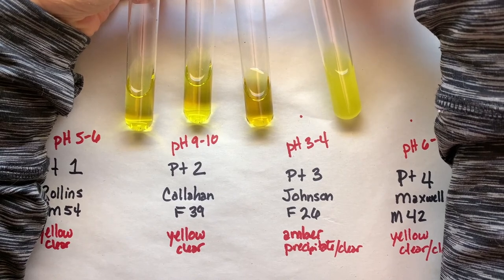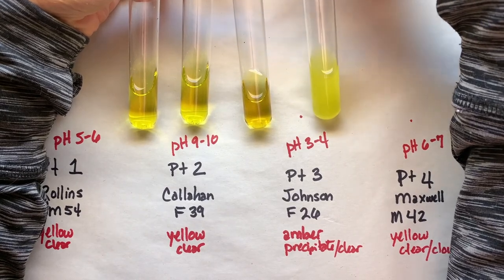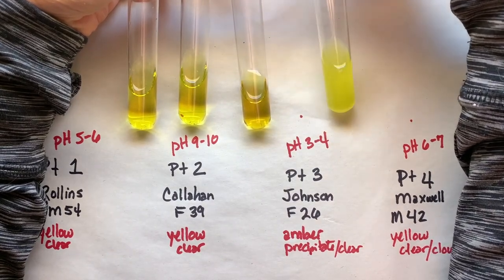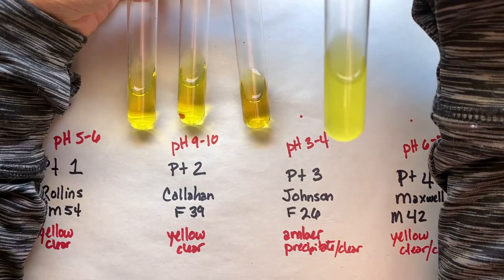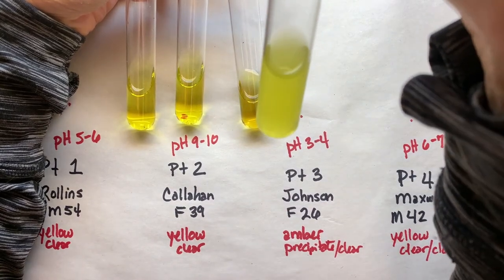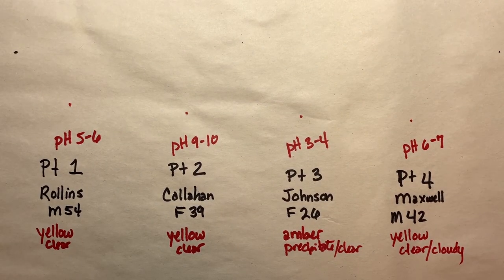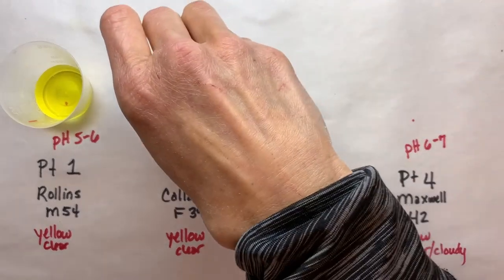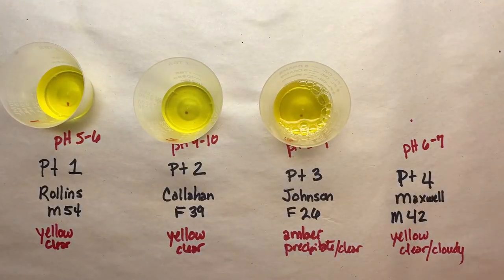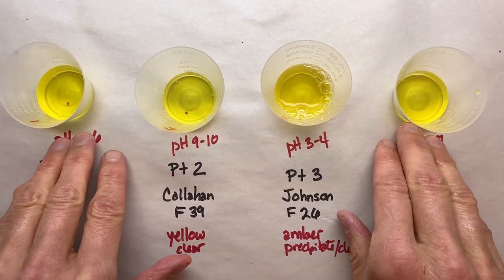Right, so we could say that we're testing for the presence of protein, and in this situation, even though we didn't get that nice red color because of the quality of the material that we're using, we did get quite a change there though. This one is definitely showing a precipitate falling out of solution. So we could say that there was a reaction there, but because it's not the right color, we can't say for sure that that's protein. But we could make a good surmise based on that big cloudy change. Okay? All right. So we'll have to do that one again.